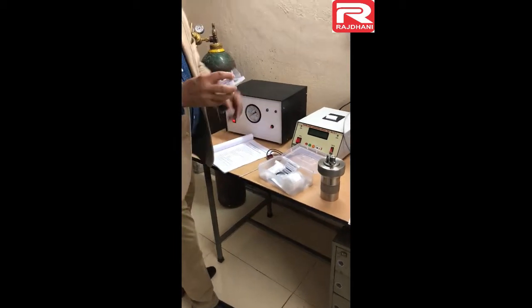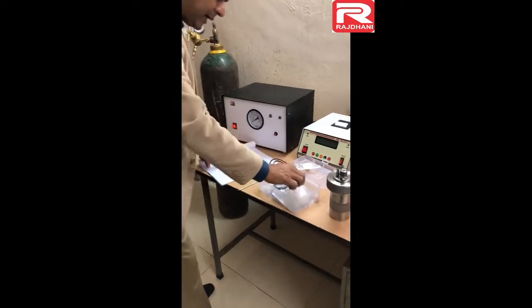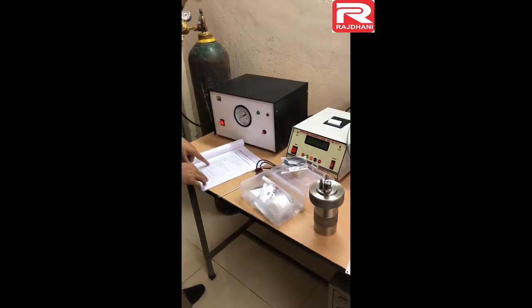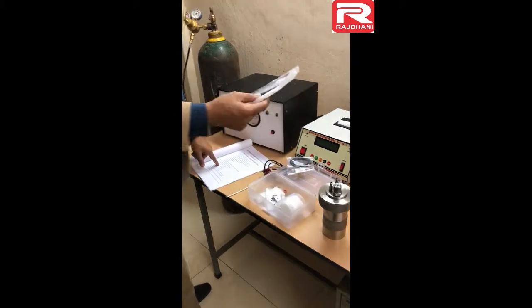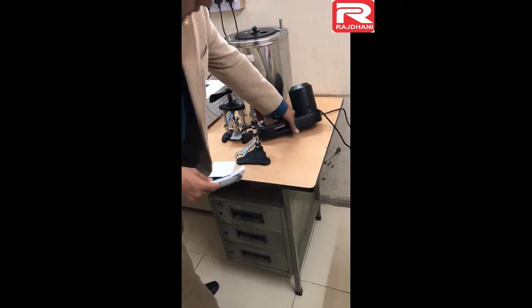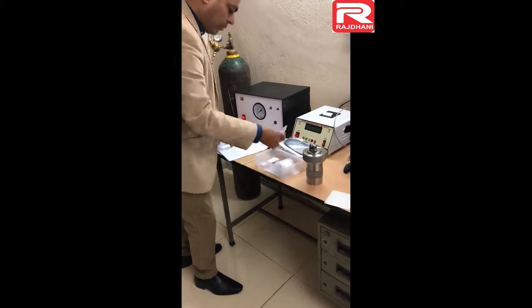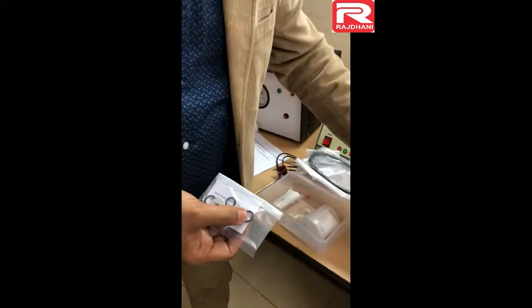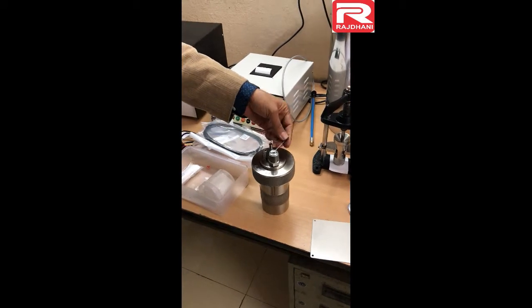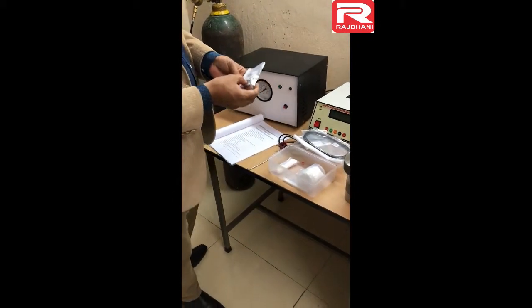Item number 15 is the crucible — this is a stainless steel crucible in which the sample is kept. Then there are the bomb O-rings: 3 numbers are given as spares, with one already fitted inside the bomb. Then the stirrer belt — similarly, one number is fitted in the stirrer and 3 are given as spares; it is tied here and can be opened by releasing the knob. The next part is the wall body O-ring — this smaller O-ring is called the wall body O-ring. It is fitted on the wall body and is tied with thread so it may not get displaced during transport. Three are given separately as spares.